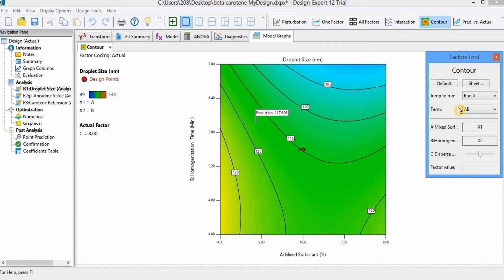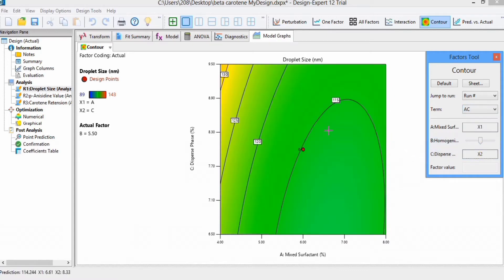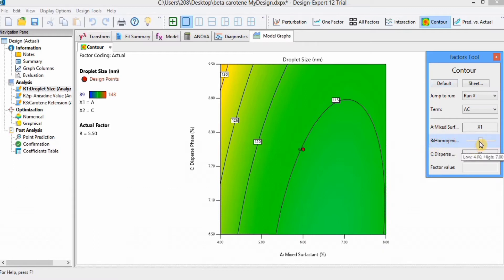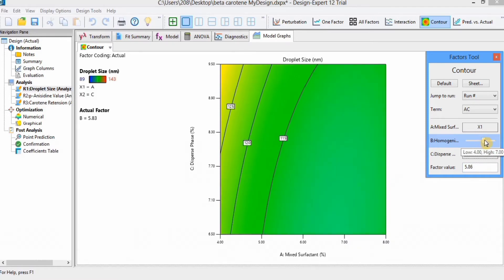You can change the terms from here. If I change to AC, you can see the factors become mixed surfactants and dispersed phase, while the third variable is at zero or central position. You can also see in the Factor Tools that the homogenization point is at the central location. You can click on it and change this position, and you will see the graph start changing.